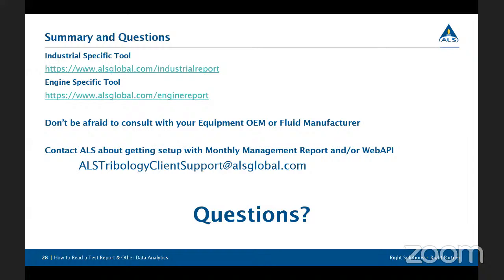They're one PDF per email. We can send off summary emails. So if you get a lot of samples at one time, maybe you're getting 20 in a day, we can put those all in one email, and there's a hyperlink that goes straight to these PDFs, which makes it really quick and easy. You can obviously go pull them off of our website once you're set up there. So there's a lot of different ways. Seems like it'd be good for us to put together a guide.